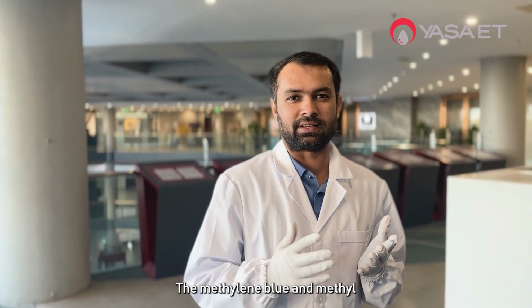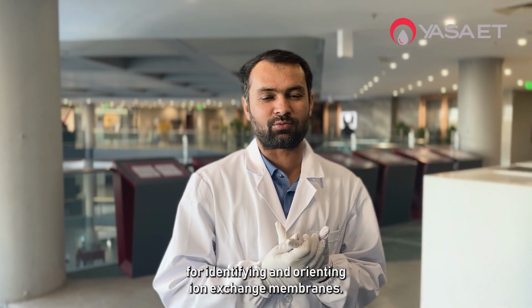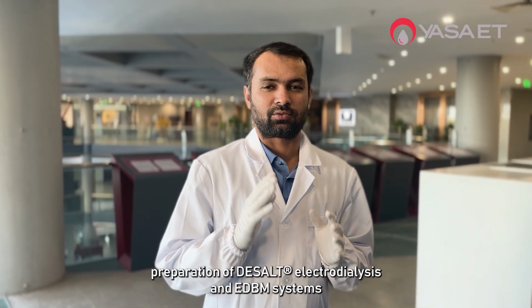The methylene blue and methyl orange dye test is a practical and reliable method for identifying and orienting ion exchange membranes. It is widely used in laboratory practice and supports accurate preparation of electrodialysis and EDBM systems developed by YASAET.